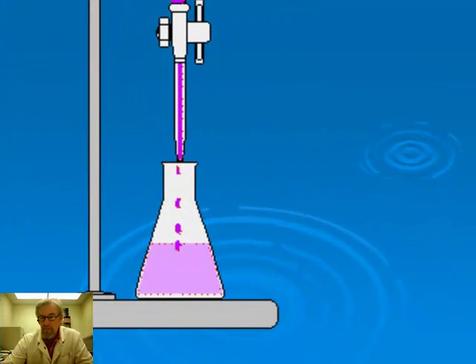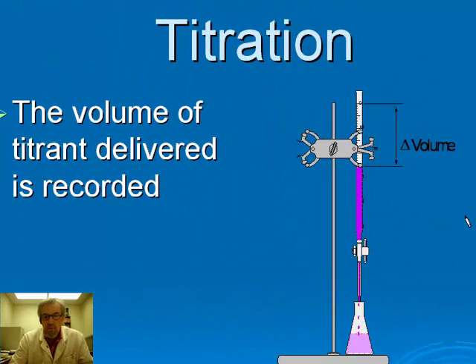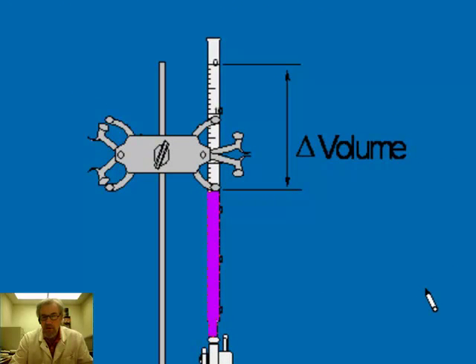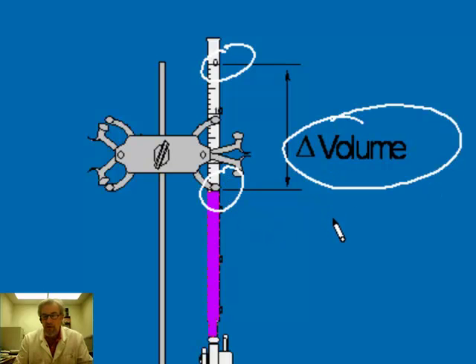And there you see the visual cue. It changed from a pale yellow to a pink. That's our color change indication that the endpoint has been reached. Once you reach that endpoint, then you measure the volume of titrant that was delivered to reach the endpoint by looking at the difference between the starting reading on your burette and the ending reading on your burette. That's a change in volume. The amount was delivered, and then you're going to record that to use it in calculations later.